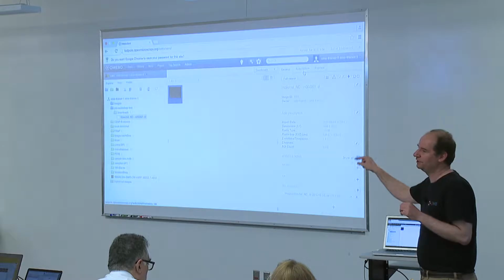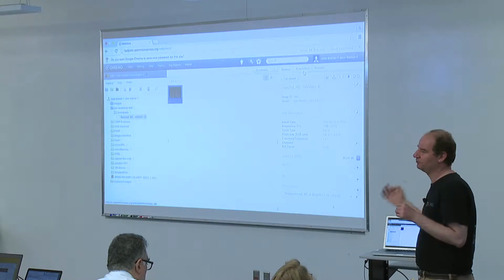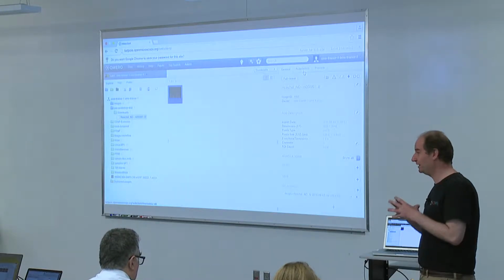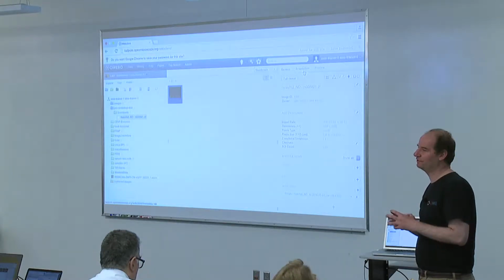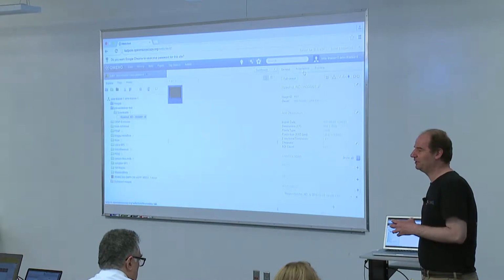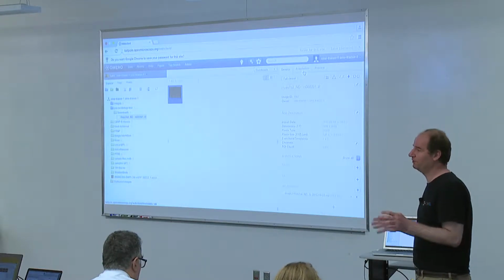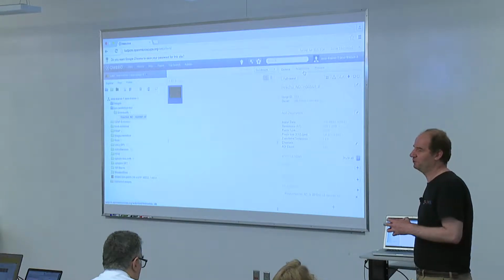The reason I'm doing this, what just failed so badly, once more apologies, is that we are on the road and we just flew yesterday from Dundee. We could go the way which we tried in this city last year and try to connect to the server which is in Dundee. It goes fine, but with a workshop of 40 people, it's still not the best, because this is again not a workflow which you would normally do. But if you are in a hotel in Singapore and you just want to browse your own data, and you will probably be the only one who is going to bother to connect to OMERO from the hotel in Singapore, you will be pretty fine.